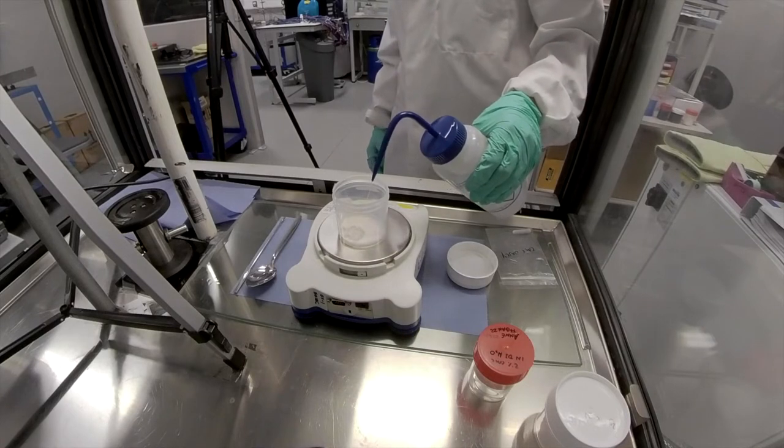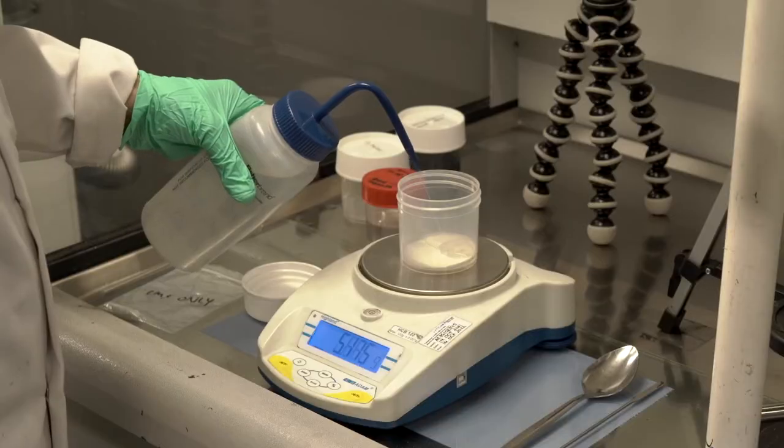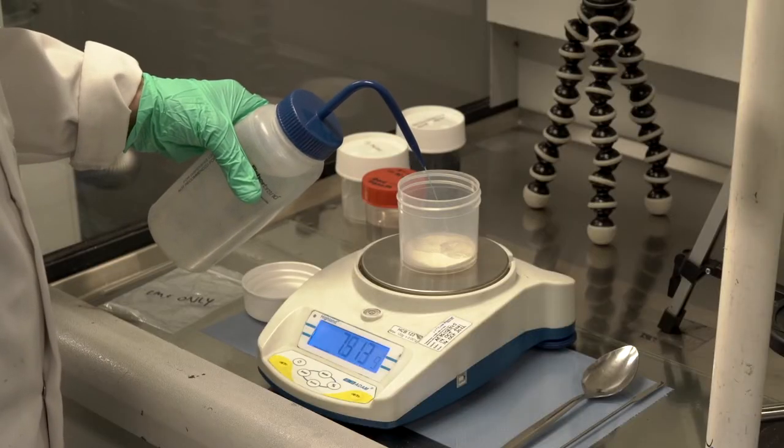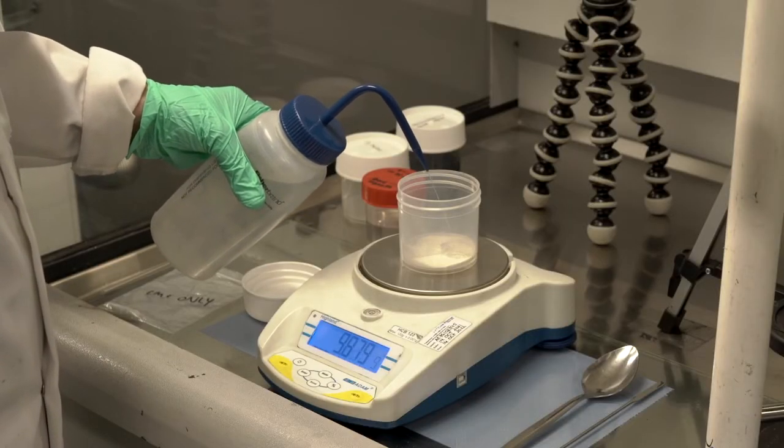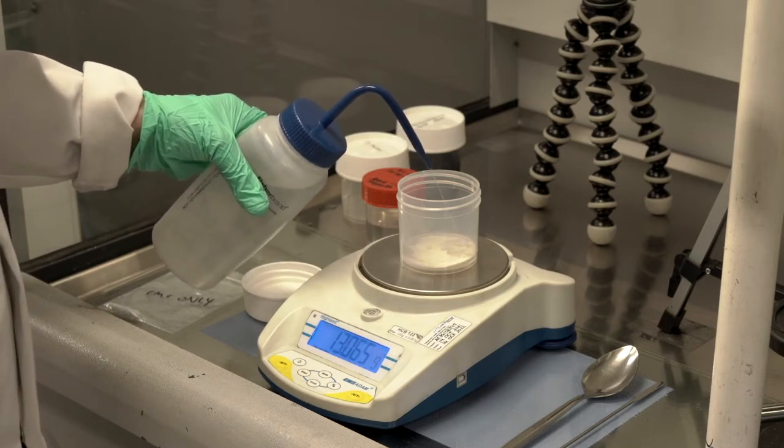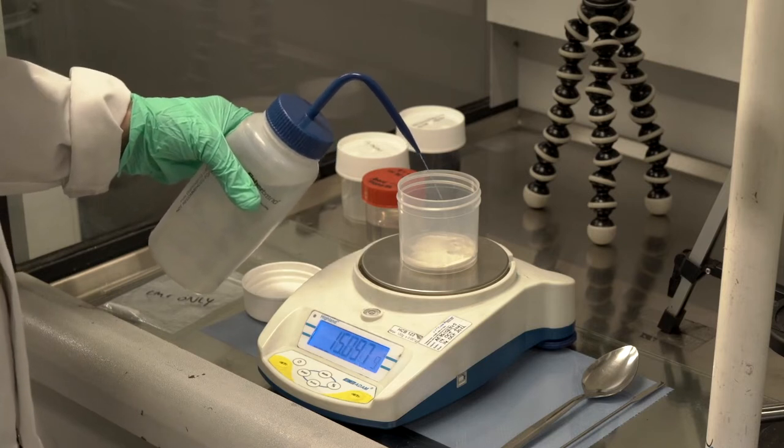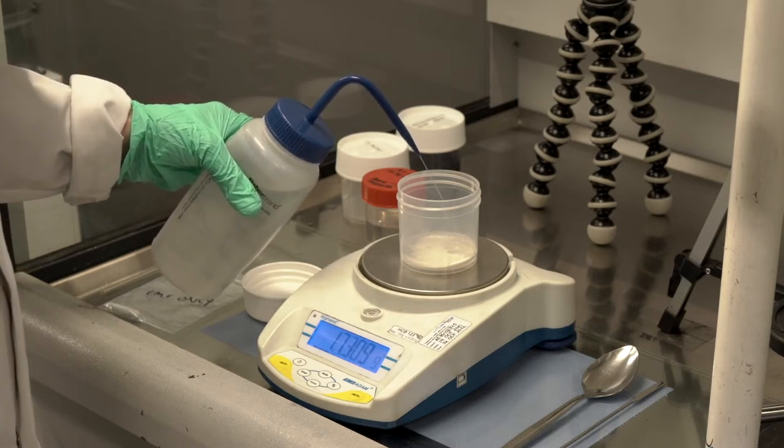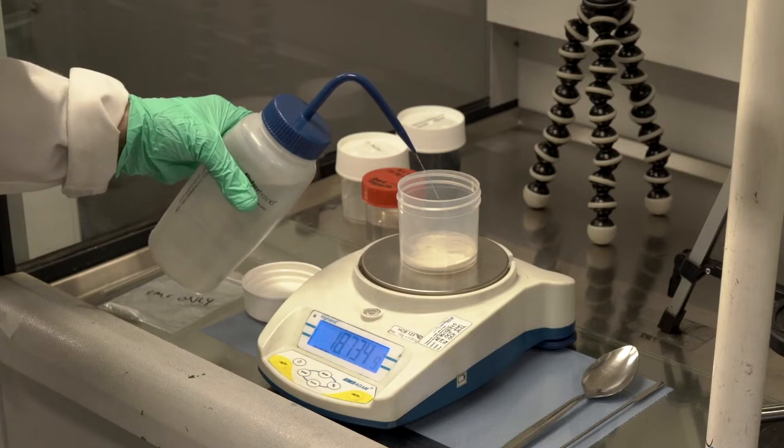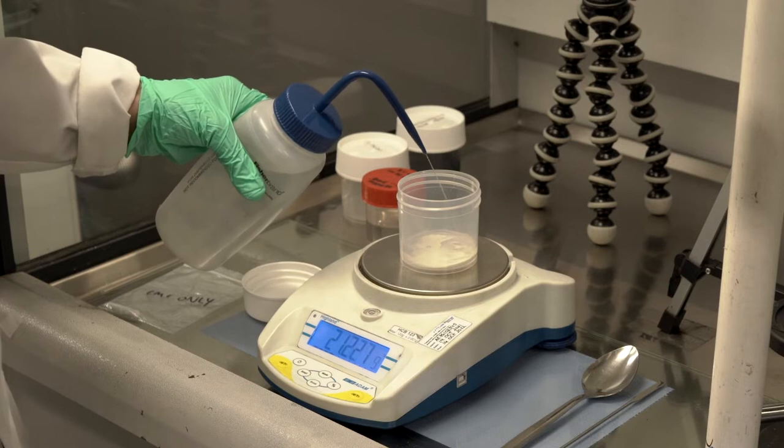Now, to mix this, I generally use a magnetic stirrer, though any mixing method should work. I might put some heat up to 80 or 100 degrees Celsius while it stirs, and I might leave it to stir overnight. But truthfully, the only thing that will really give me a homogenous CMC solution is time.